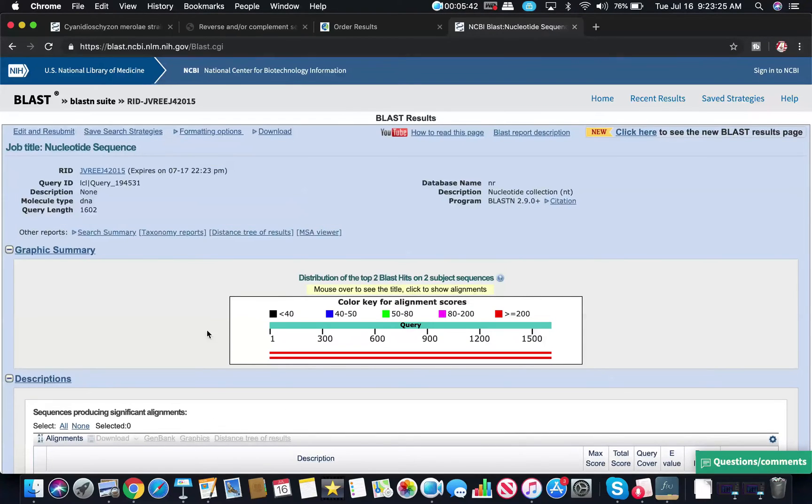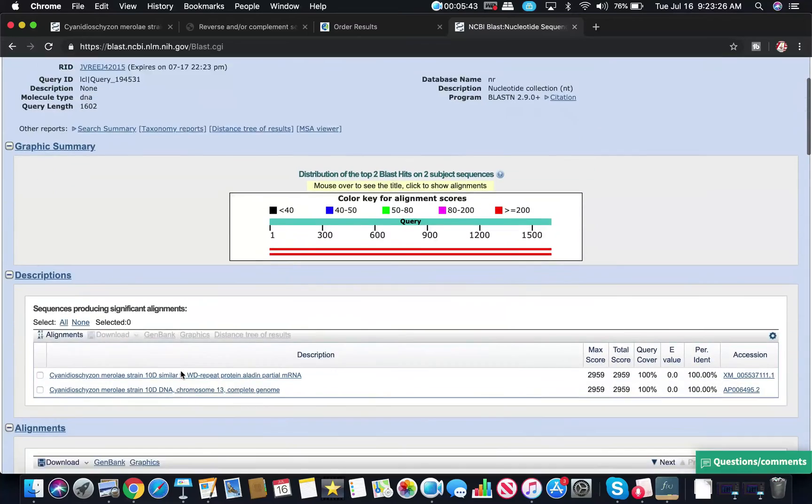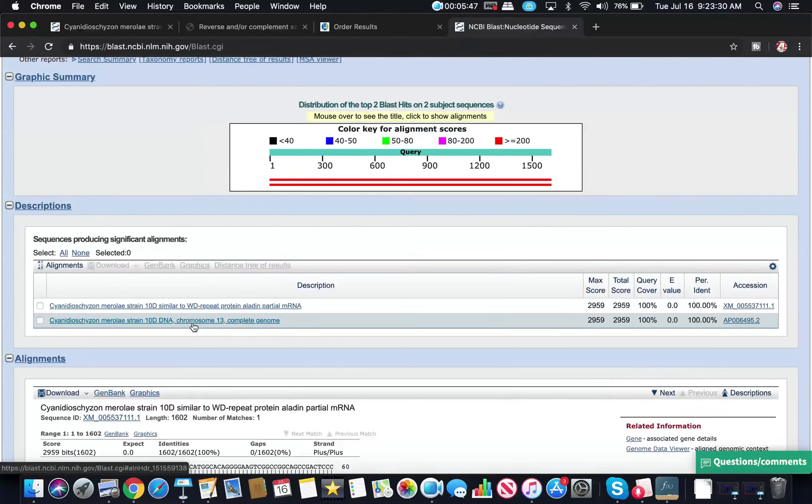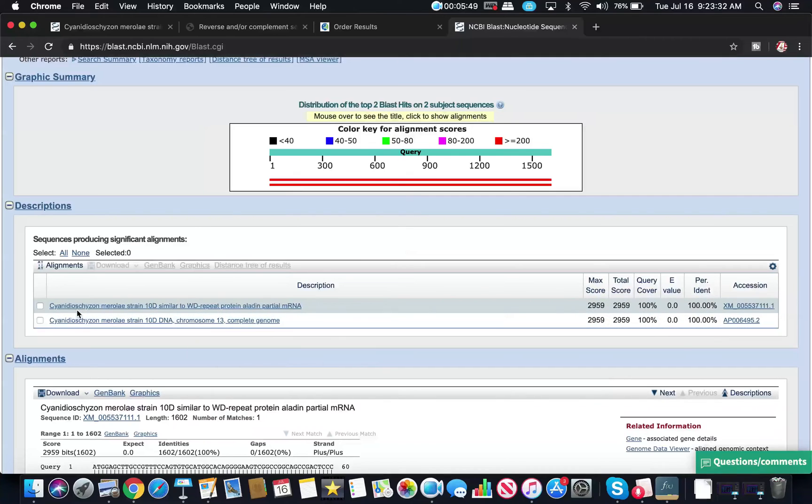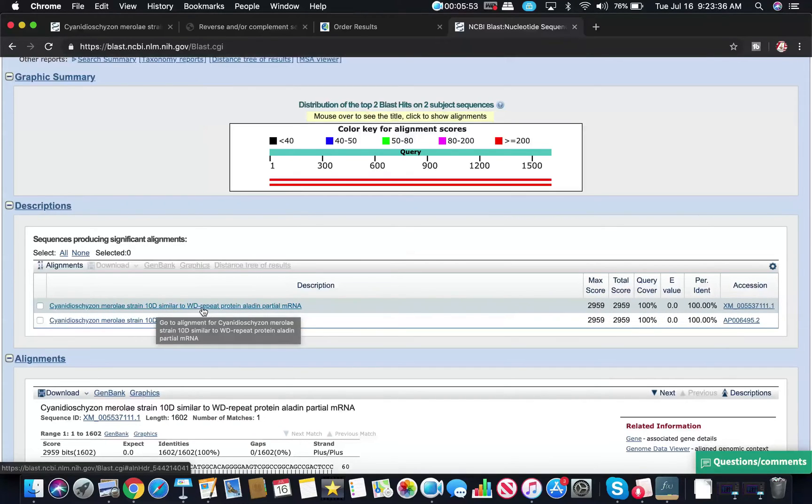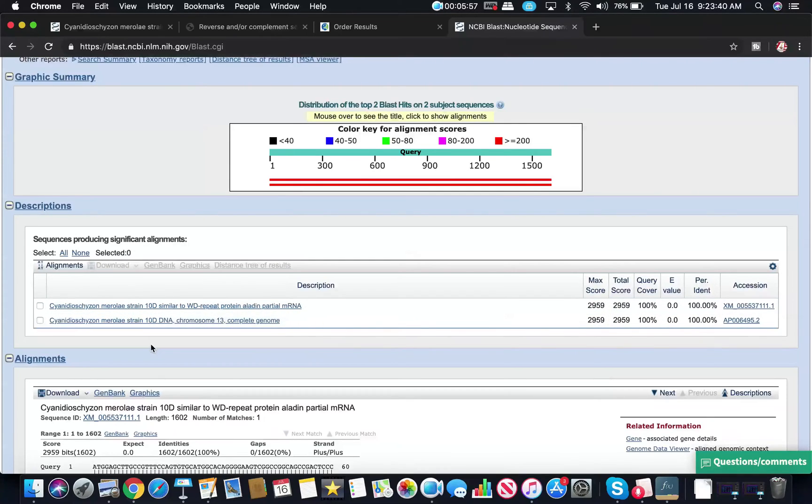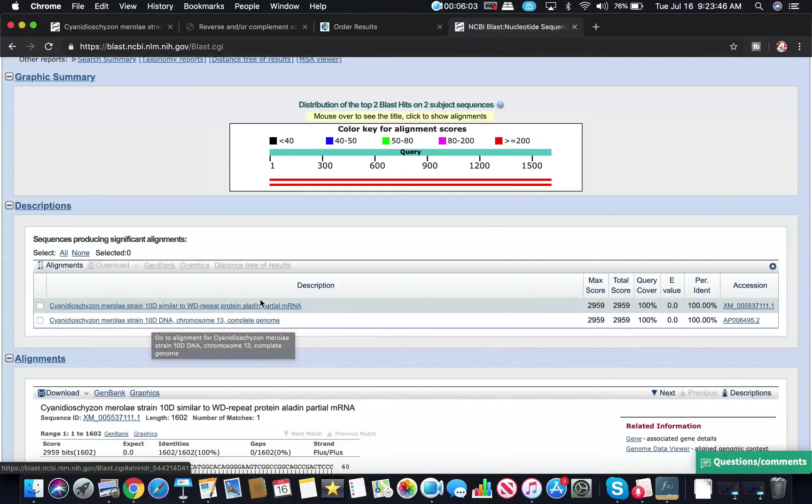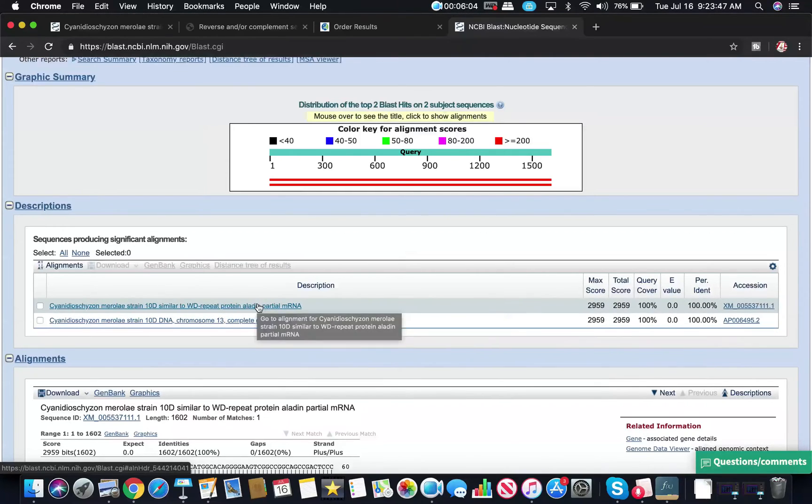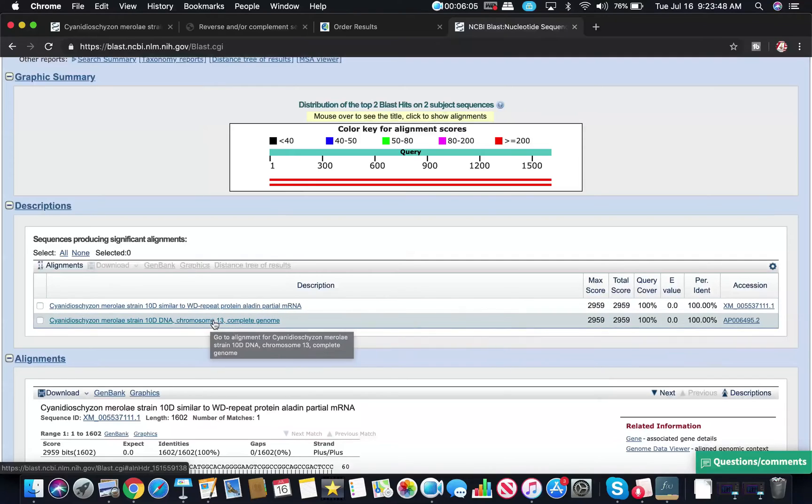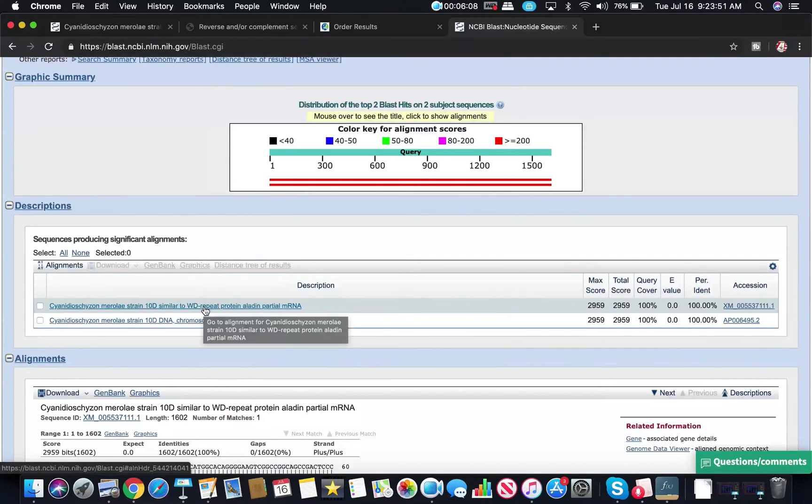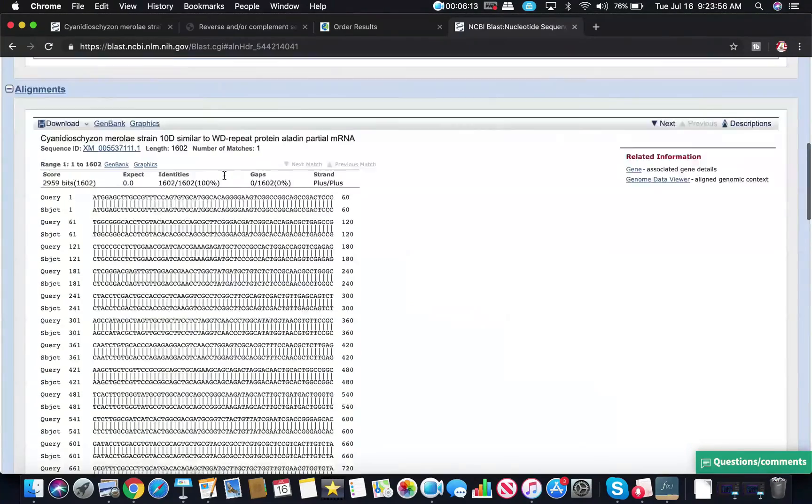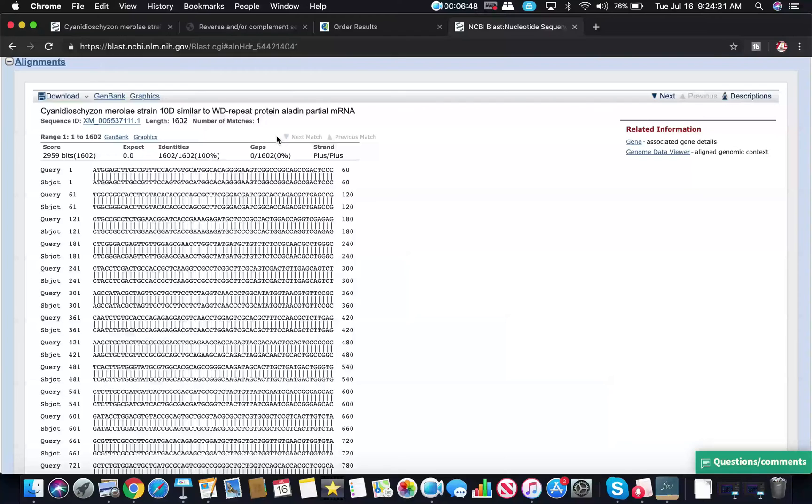So I'll just need to scroll down a little bit and I have two possible results. Here I have Cyanidioschyzon merolae strain 10D similar to WD repeat protein Aladdin. That seems pretty hopeful. Sometimes you'll also see something listed here, the entire chromosome, because apparently Aladdin, the gene for it, is on chromosome 13 in this organism. But normally I'm good to just click this first one. You'll notice when I click on it, it takes me down here.